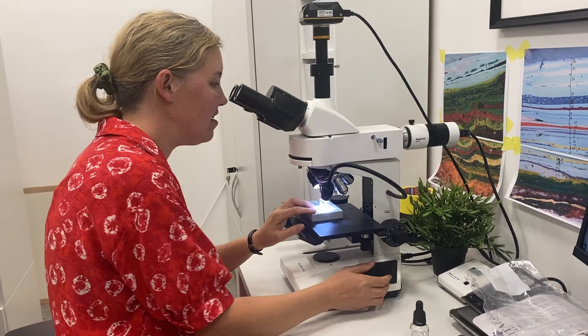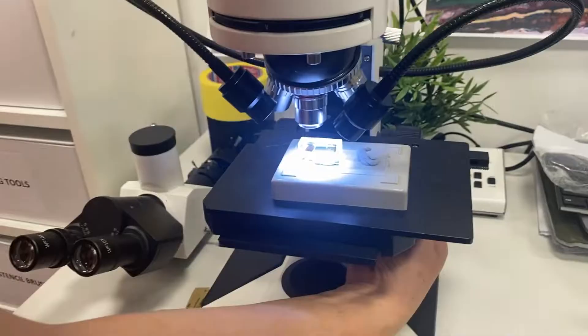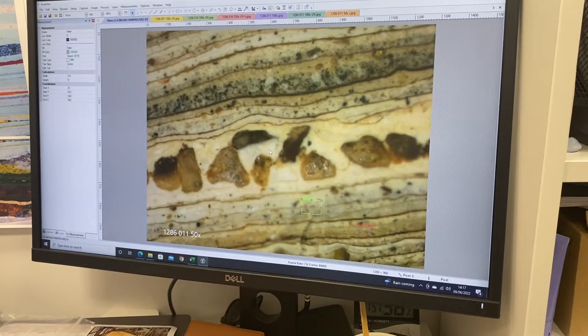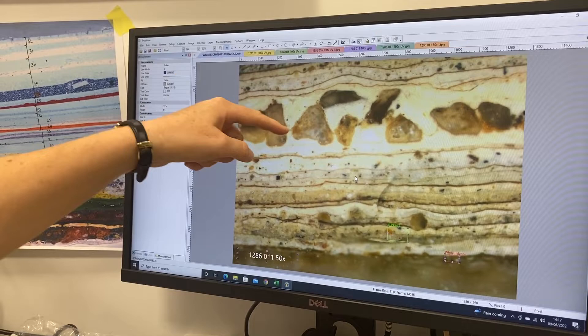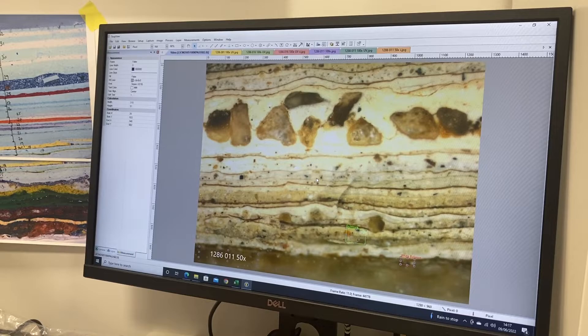It's set up so you can see. So tell me about that layer. That's the famous sanded layer where you can see in a very neat line the sand laid along this layer rather than being too jumbled up, and that's the layer we think was a texture layer. How many layers in is that? I think that was scheme 11 as far as I remember.